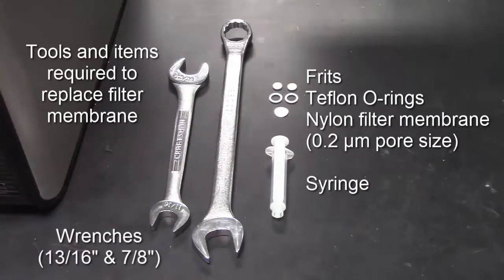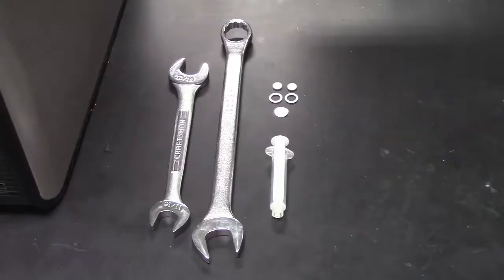The tools required to open the housing unit and replace the filter membrane include two wrenches, two new frits, two new Teflon O-rings, one new filter membrane, and a syringe to help remove the old filter.